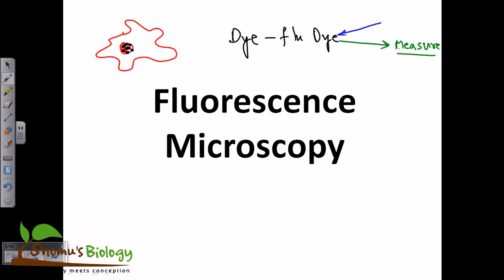And by looking at the image inside the cell, as a result of this green emission, we can find the green coloration where the dye is present. So by looking at it, we can tell where exactly our specimen is present.